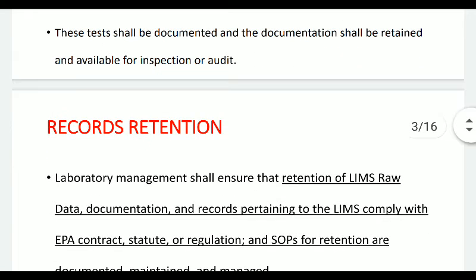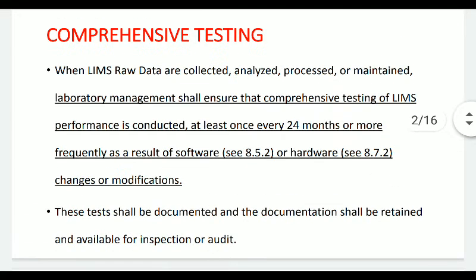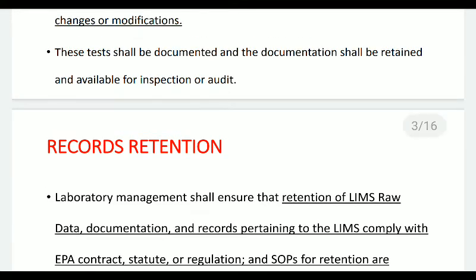So when we are facing a US FDA inspection, they may ask you for the documentation pertaining to the comprehensive testing. So no matter at what frequency you are doing this comprehensive testing, it is compulsory to maintain proper documentation, and this documentation should be produced during the audit or during the inspection by any external agency.